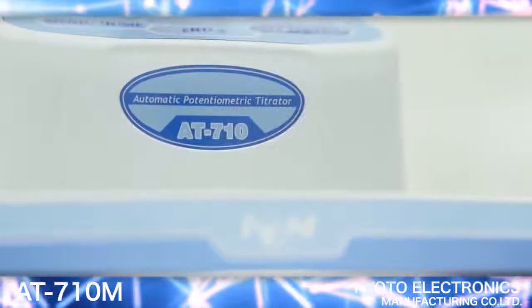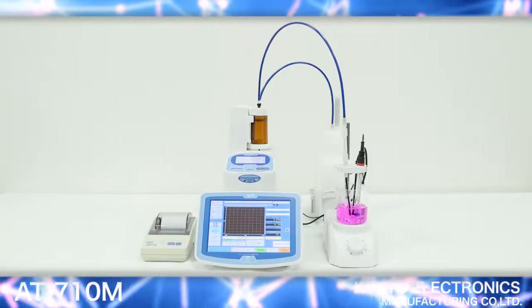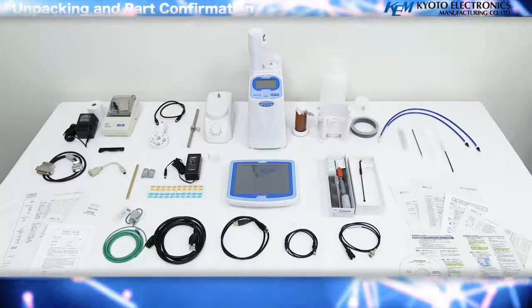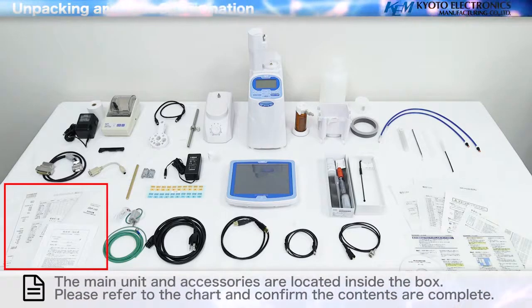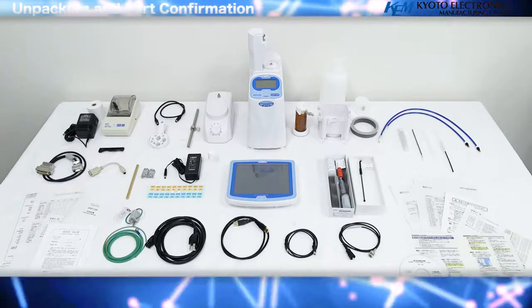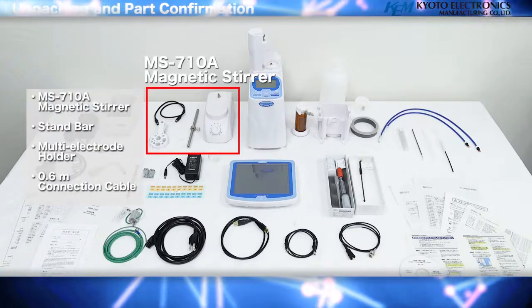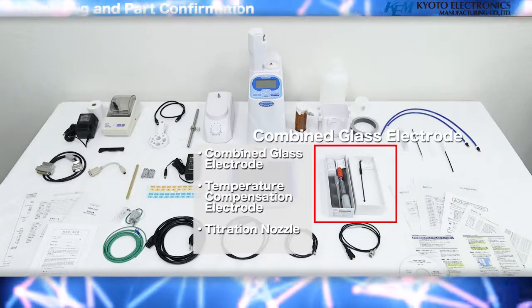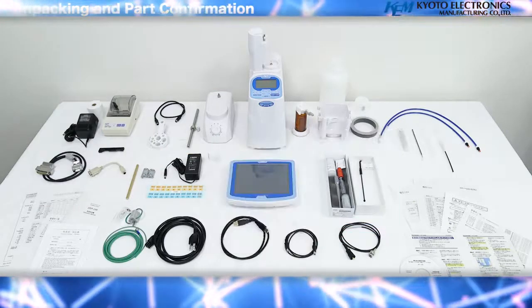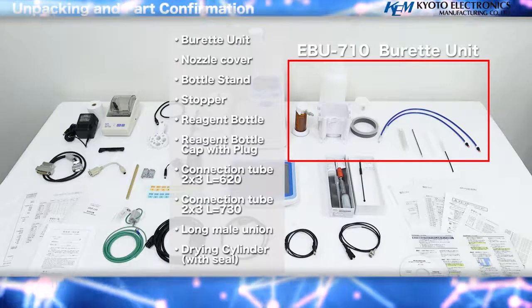An explanation regarding the use of the AT710M. Unpacking and Parts Confirmation: the main unit and accessories are located inside the box. Please refer to the chart and confirm the contents are complete. Included parts are the MS710A Magnetic Stirrer, Combined Glass Electrode, EBU 710 Buret Unit.